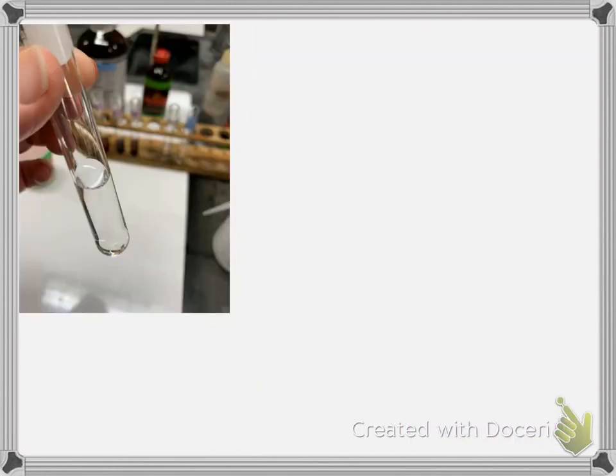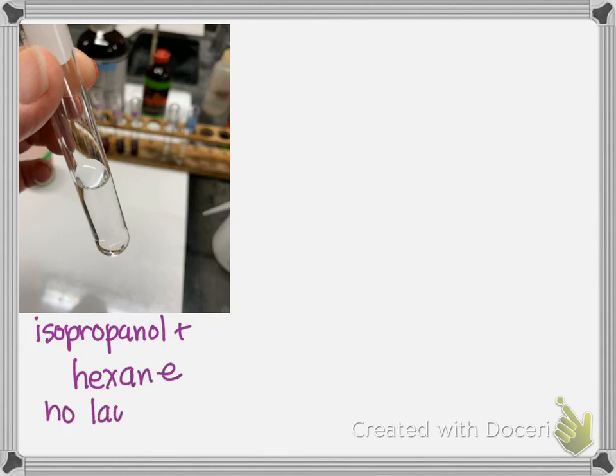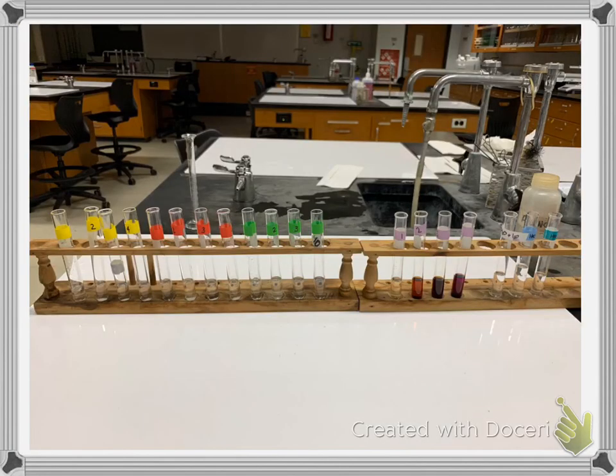Now this is the last one, and this was isopropanol and hexane. And there is no layers. And so you write your observation there.